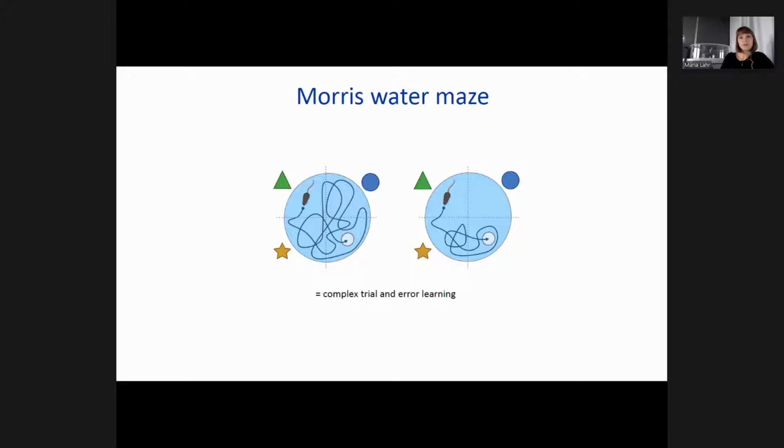And when we do the 4 trials every day, what we have to consider is that we put the mice in different locations into the arena. This is really critical. So I have already marked it out here a little bit. You see that there are different zones that I have highlighted that help us to define the behavior a bit, but we also like to use them because like this, we have 4 entry points that we can use every day. We can put the mouse here or here or here or here. And that we do every day. We use all these 4 entry points, but we randomize the order.